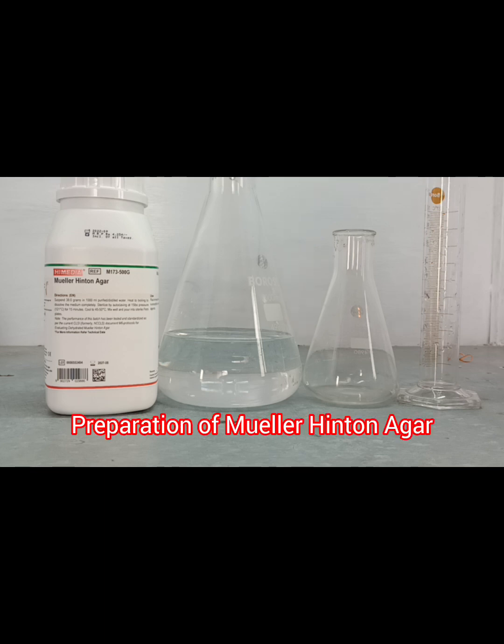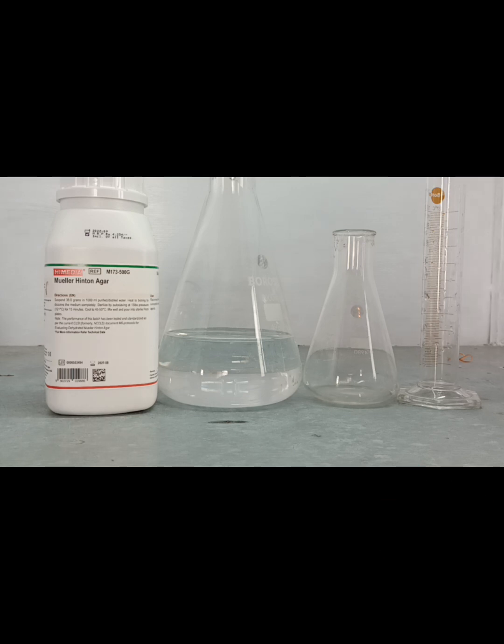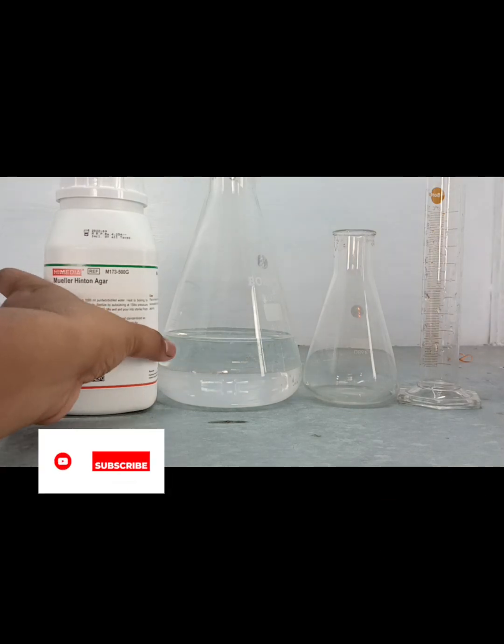Today we will perform Mueller Hinton Agar preparation. This agar is generally used for the antibiotic sensitivity test. What are the components of this agar?